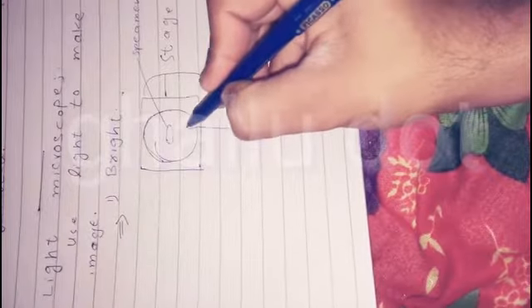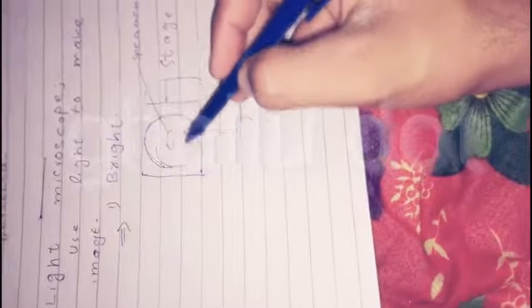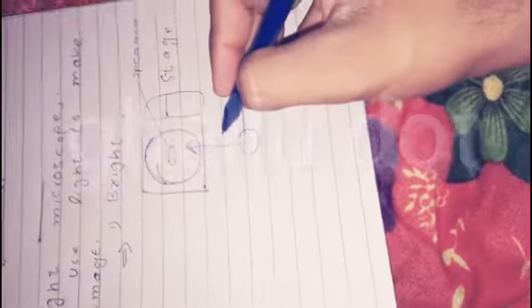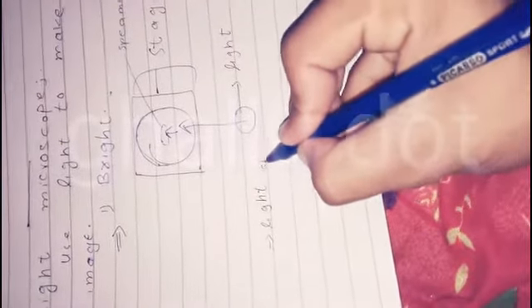The object placed on the stage will absorb the light, and the image formed will be dark.